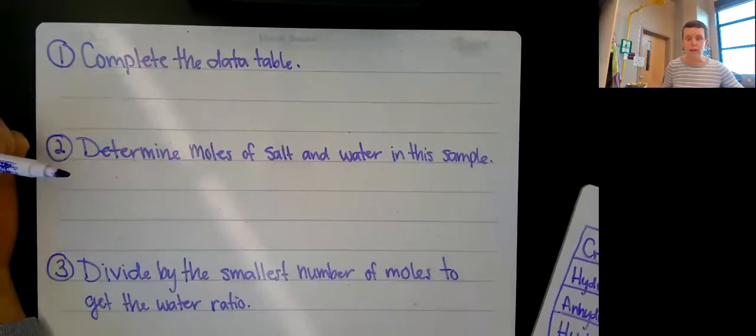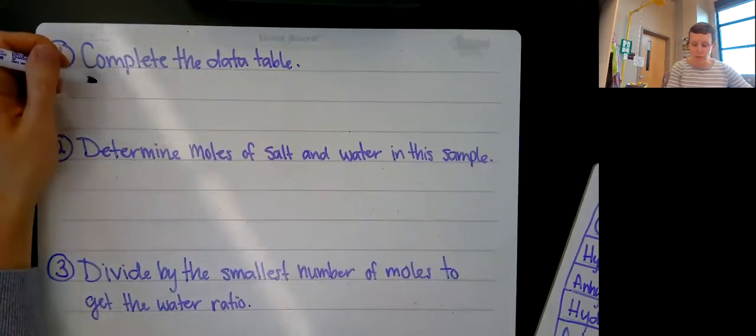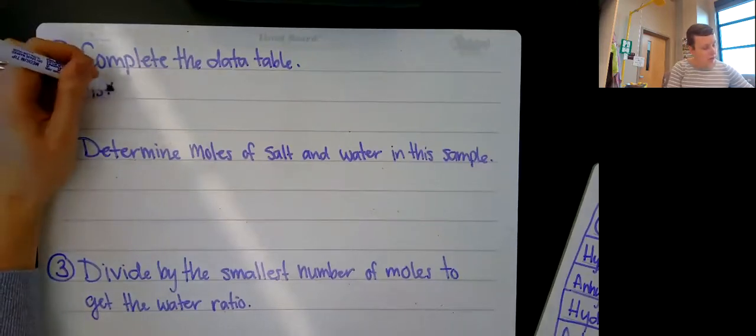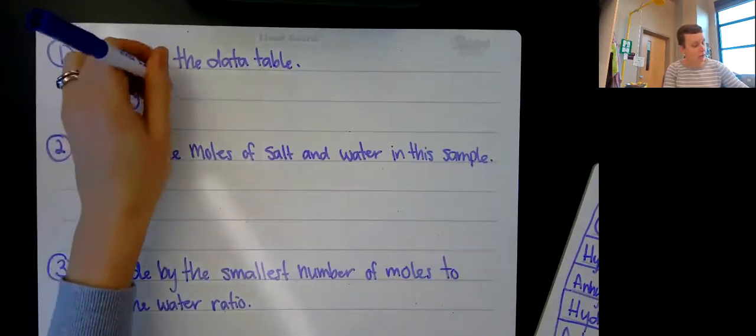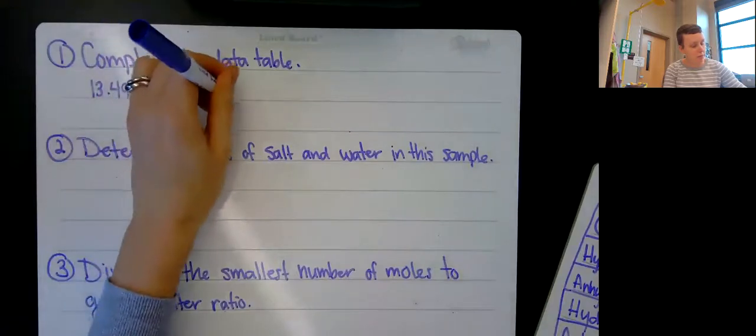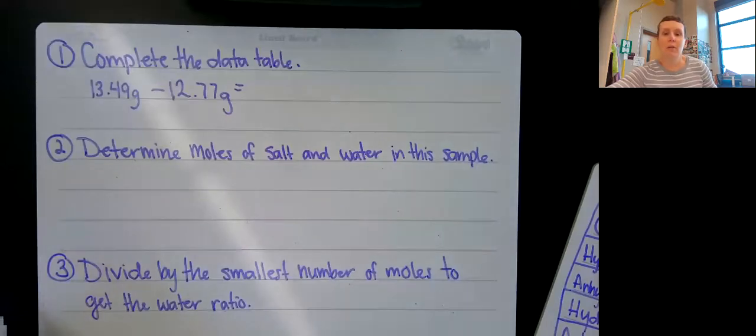Well, for the hydrate, we have in the data table the mass of the hydrate in the crucible, and we have the mass of the crucible. So this is like the mass of a box of shoes and the mass of a box. We subtract and we can figure out the mass of the shoes. So the hydrate in the crucible was 13.49 grams, and the crucible by itself was 12.77 grams. We do that subtraction and we end up with a number.